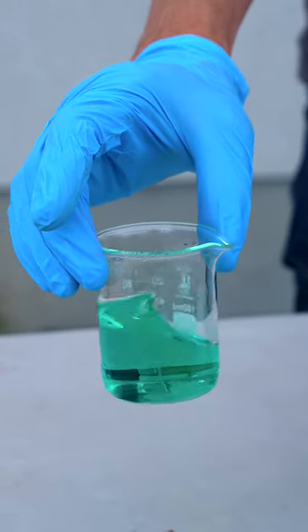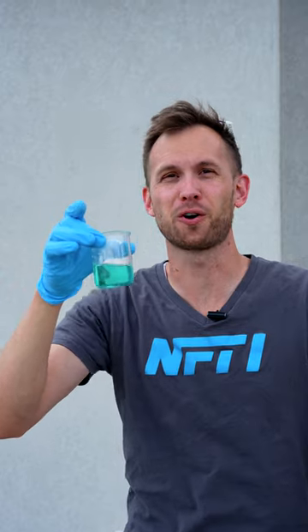It didn't take long — the pennies are completely dissolved. Follow for more cool experiments.